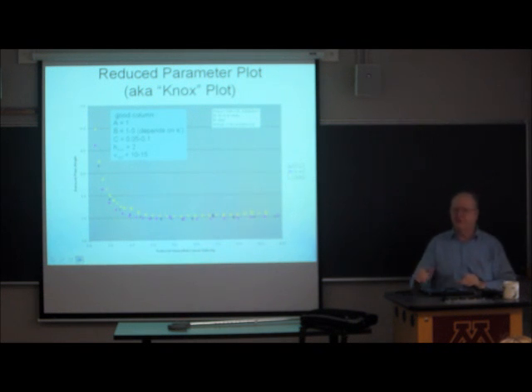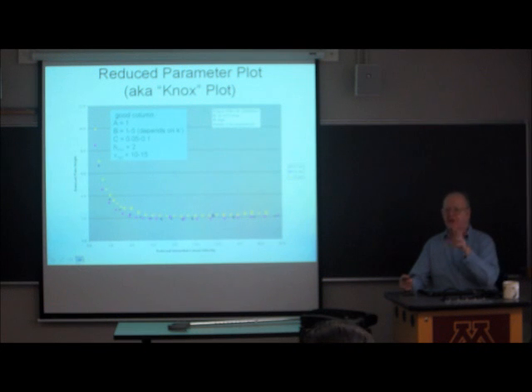So if I were to fit the three curves individually to the Van Deemter equation, what I'd find is that the A would equal A would equal A, the B would equal B would equal B, and the C would equal C would equal C in the dimensionless coordinate system. So there's less to remember.